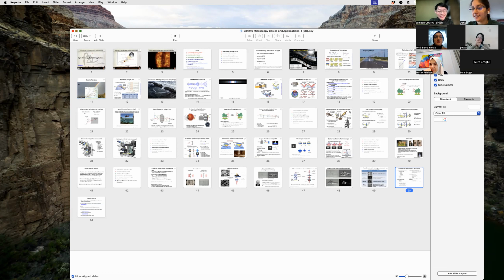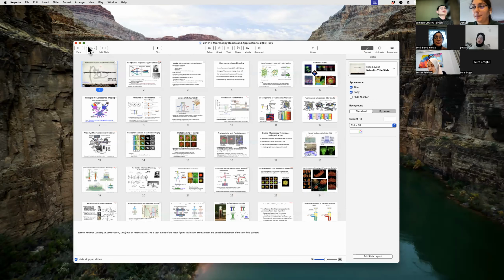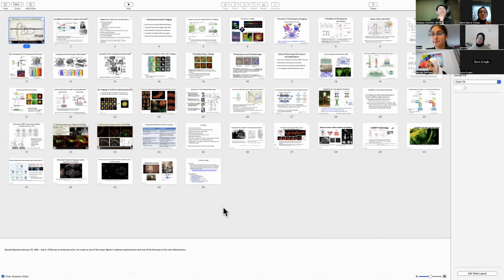How to change the resolution with an infinity corrected microscope?